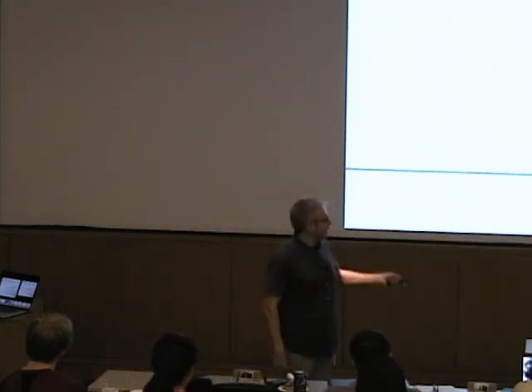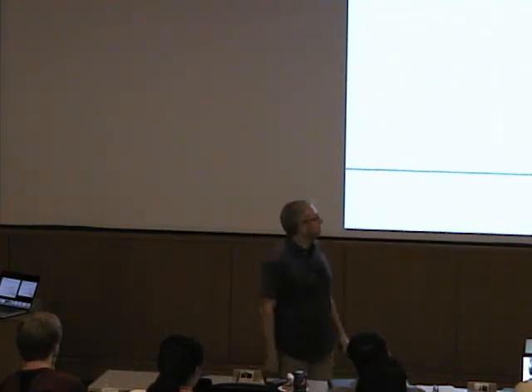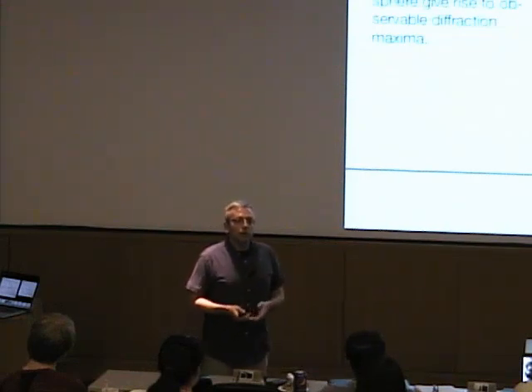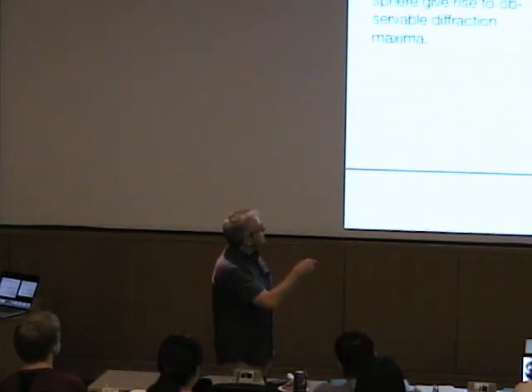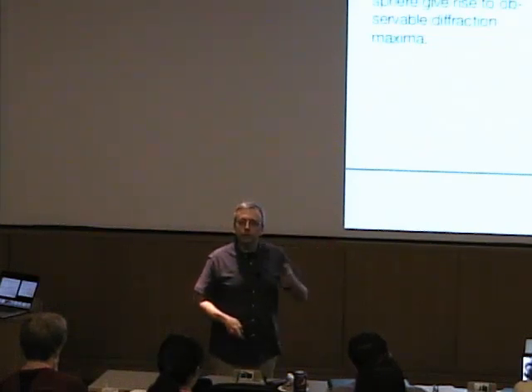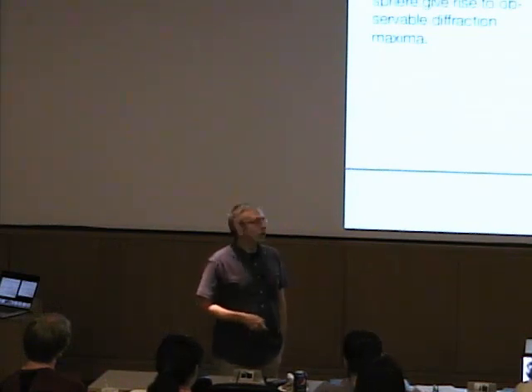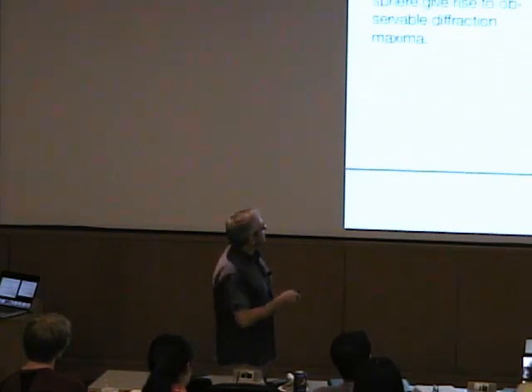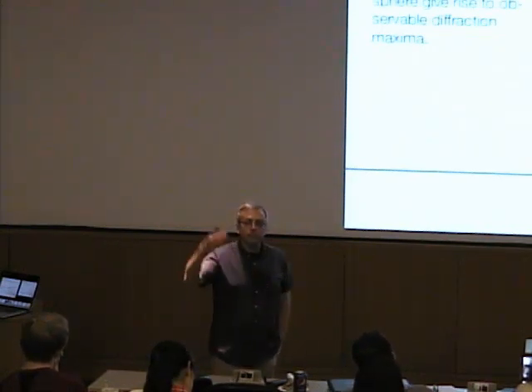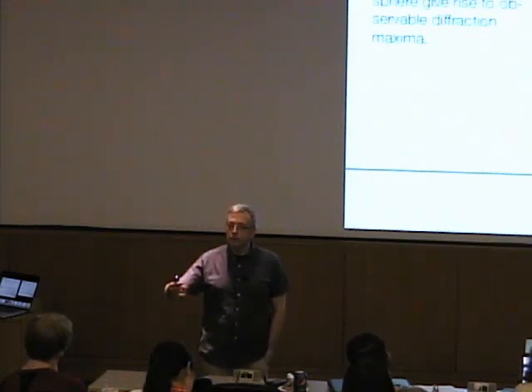And in the same space, in the angstrom to the -1 space that I'm drawing my sphere, I can also draw my reciprocal lattice. And that then would be somewhere here. My reciprocal lattice with the axes HKL is somehow intersected by Ewald's sphere. And Bragg's law is only fulfilled if a spot is on the surface of this sphere. That means, in this picture, only these reciprocal lattice points would actually give rise to diffraction spots on the detector. And that is why we get these strange patterns.